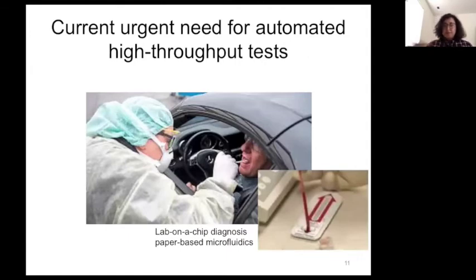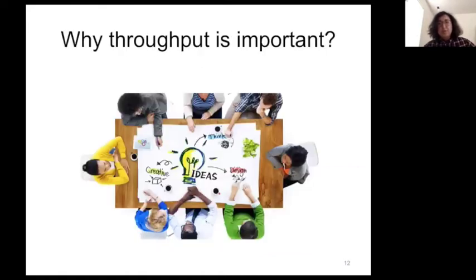Even this paper, how you design the paper mesh inside to put your blood sample or any other samples, and you can get antigens and antibodies to react in this device. It's also based on microfluidics.